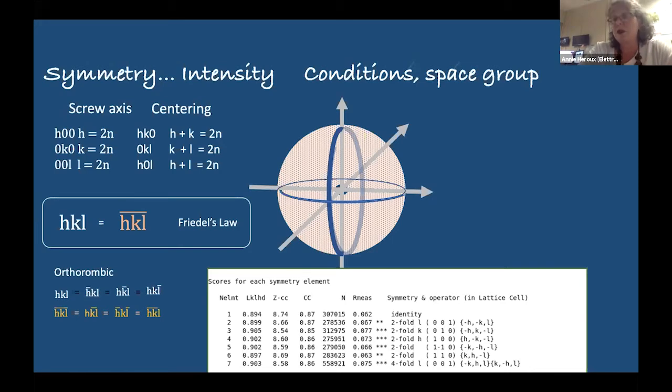This is crucial to get the position of the atoms that you want to look at. It used to be very important to do this, but nowadays it has evolved and it's not as much. The important part is to make your crystal last long enough to get enough data to be complete, but also redundant, and you will get better maps at the end.